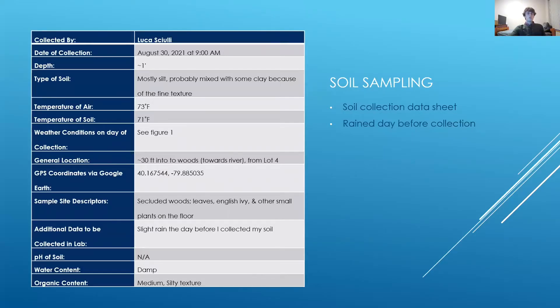The first step of this experiment was to collect the soil sample. I collected my sample from the base of a tree near the Monongahela River at California University of Pennsylvania. I removed about the first inch of topsoil and shoveled the fresh soil into a sterile tube. Then I kept my soil cool until the serial dilutions.